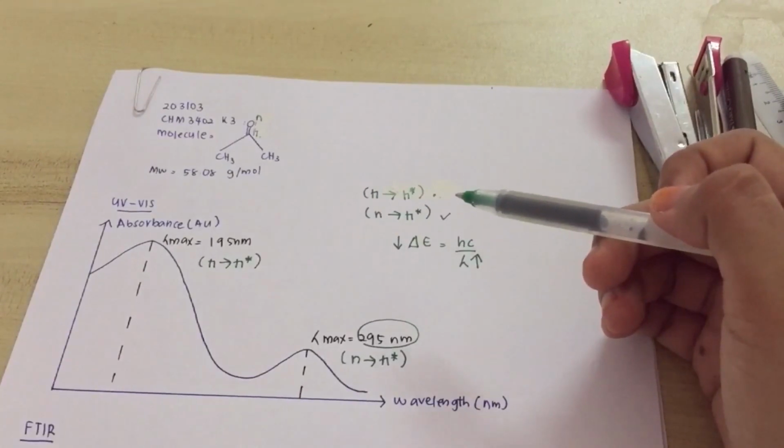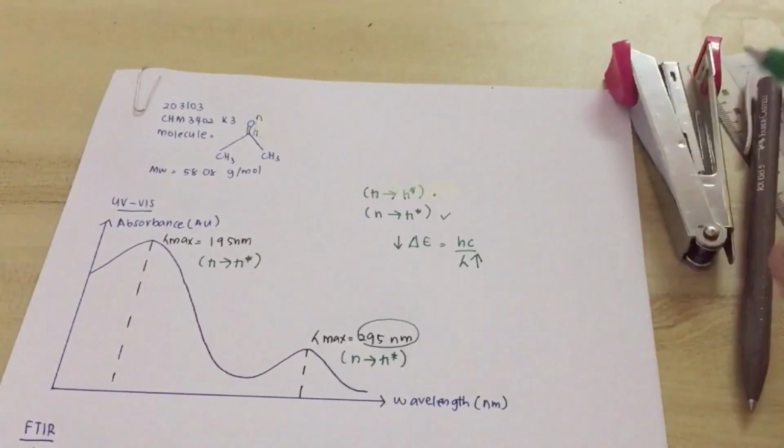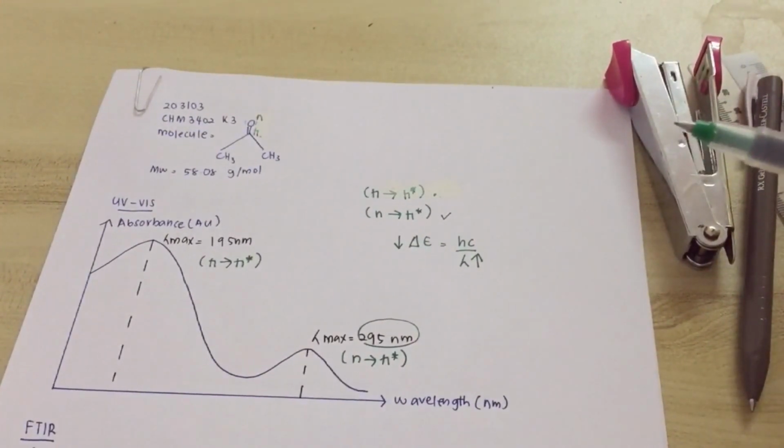Wabarakatuh. So today I'm going to explain how we interpret the UV-Vis and FTIR spectra. First of all, we will start with the UV-Vis.